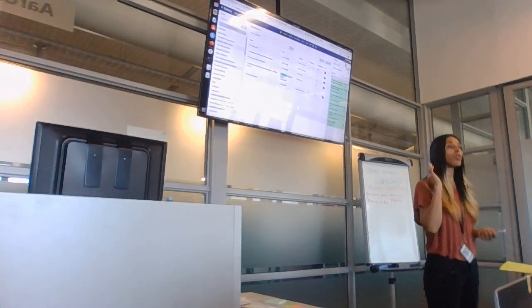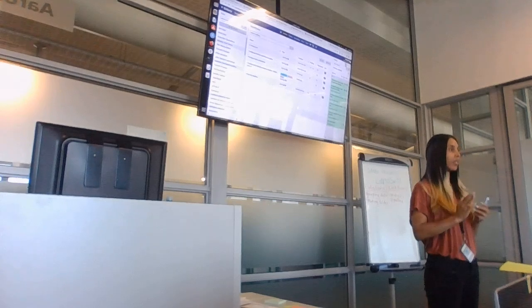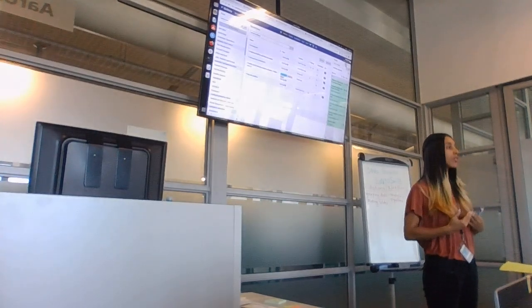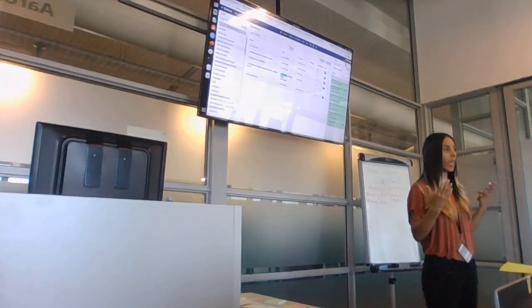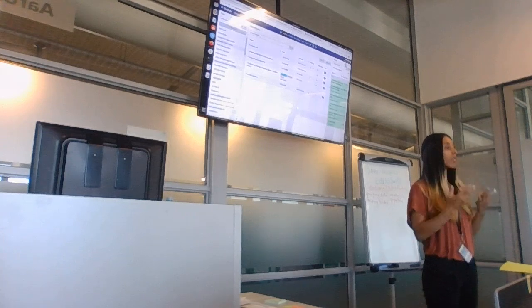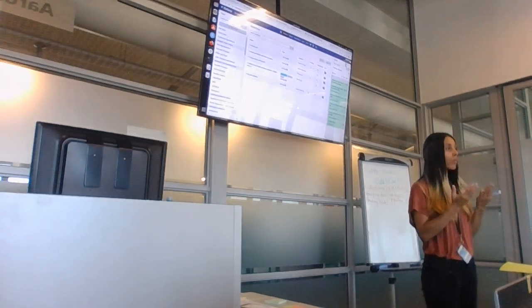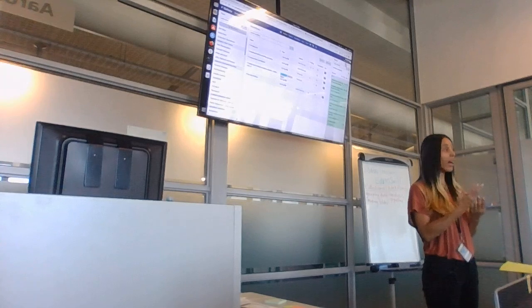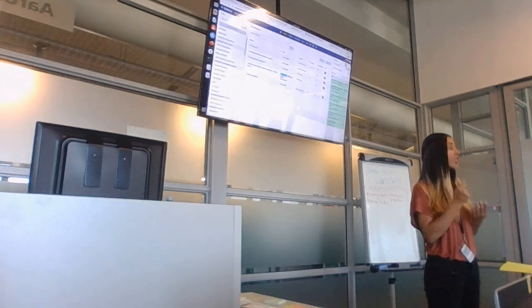Then we said, but because we have so many files, even though we run FastP, we don't want to look at each file individually, so we need a way to aggregate the output of that data, and we used MultiQC to aggregate all of the FastP files, so that we could properly see two of those files actually look different to the other 6 files based on the GC content.